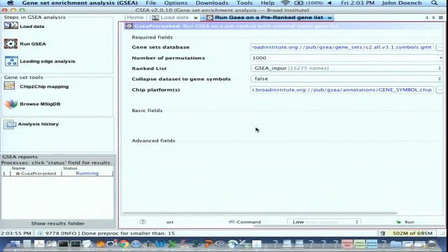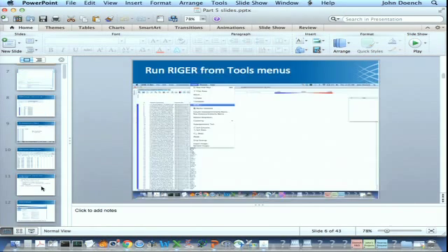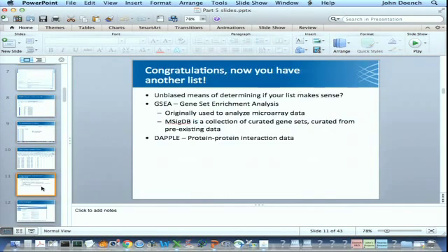You don't want to run on only 10 permutations. But to make sure that everything loaded in appropriately, you want to just first set it for 10 or something to make sure everything runs, and this changes to success at the end. So fortunately, this is why one comes prepared.